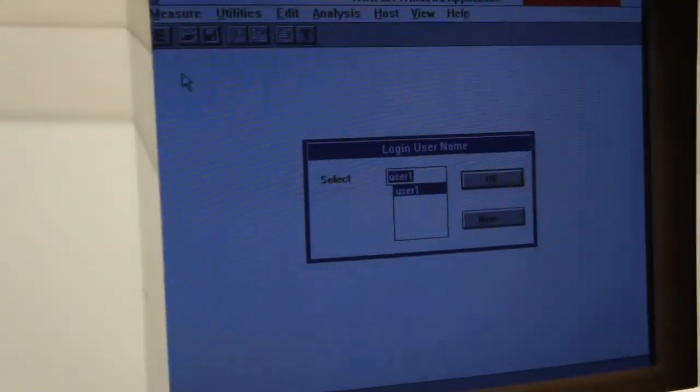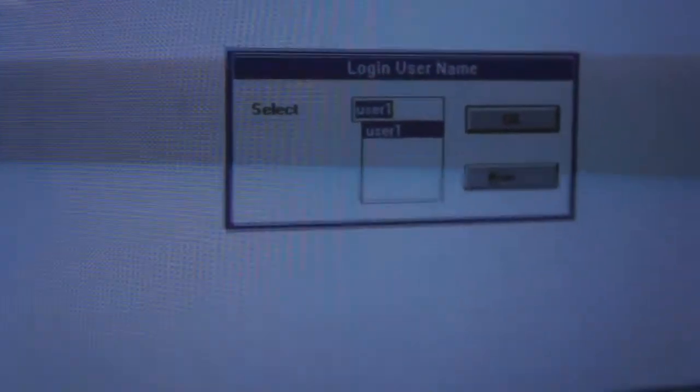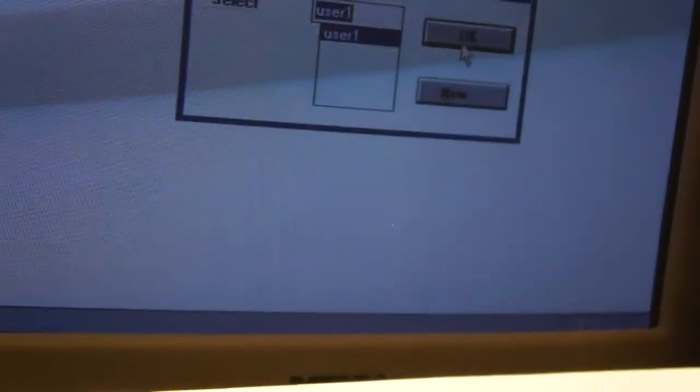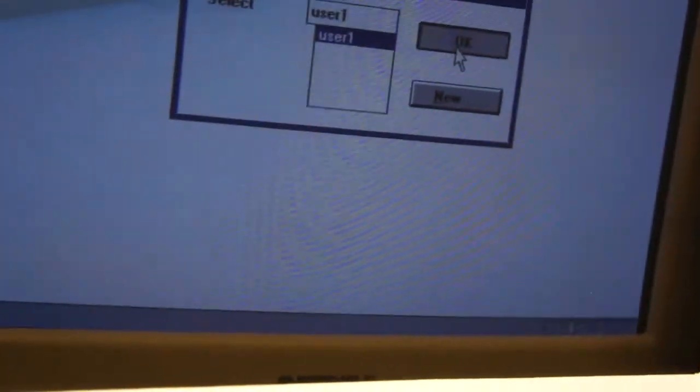Okay, so our tool has fully been initialized. Go ahead and start our user 1. Let's do a quick measurement here.